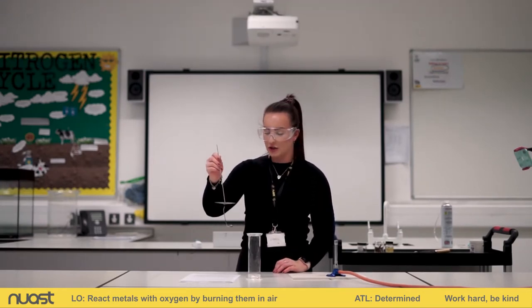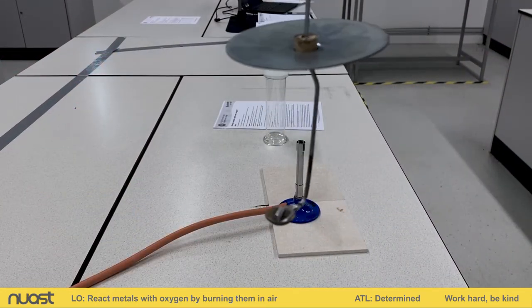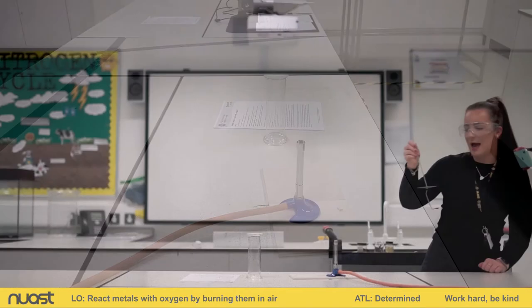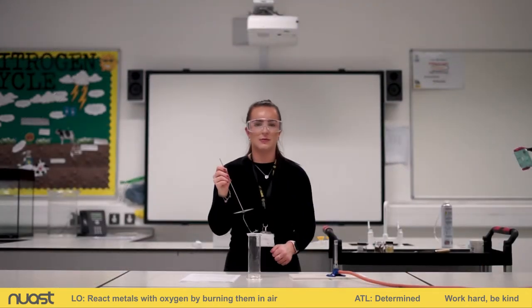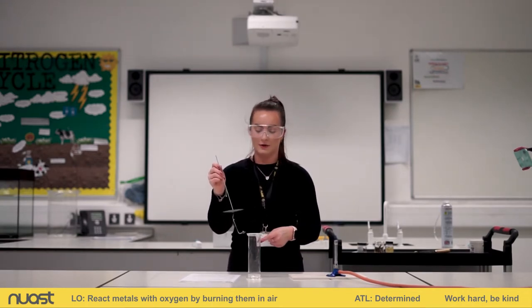Okay, so we're going on to our third metal now, and now we're going to look at magnesium. So what I have done, if I bring this up to the camera, I've got some magnesium just coiled up at the bottom of this spoon. And the first thing that I'm going to do is hold it into the Bunsen burner to see how it reacts with air, the oxygen in the air, because remember, air is a mixture of gases.